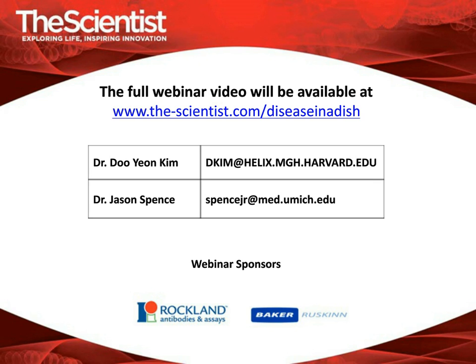Thank you. This one's for Dr. Kim as well. What do you suspect is the cause of the lack of oligodendrocytes in your cultures? Would there be a benefit to encouraging their growth? That's a very good question. I can definitely say that our cells in our 3D culture don't have any myelination, so that's not the natural condition. But I think it's very hard to answer at this moment. It definitely is different from the brain conditions, but we don't really know whether that leads to more robust pathology or less. That part we need more study to answer.